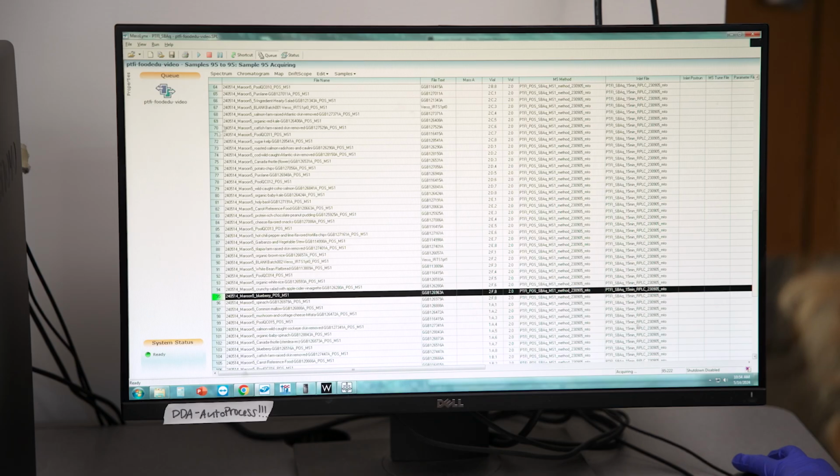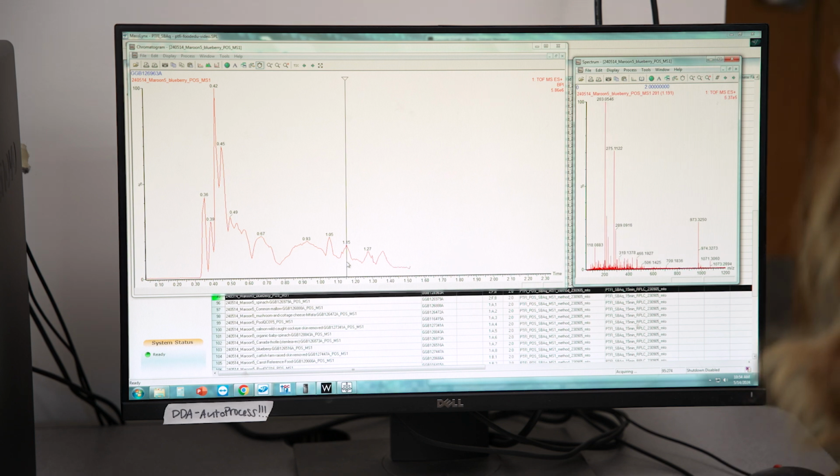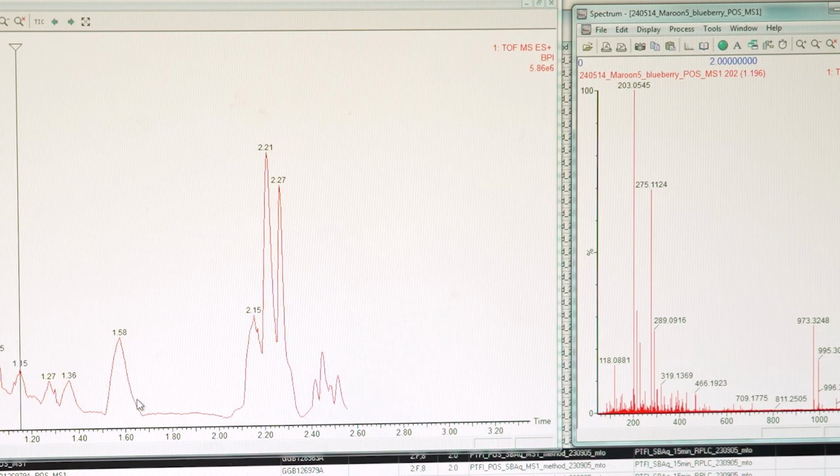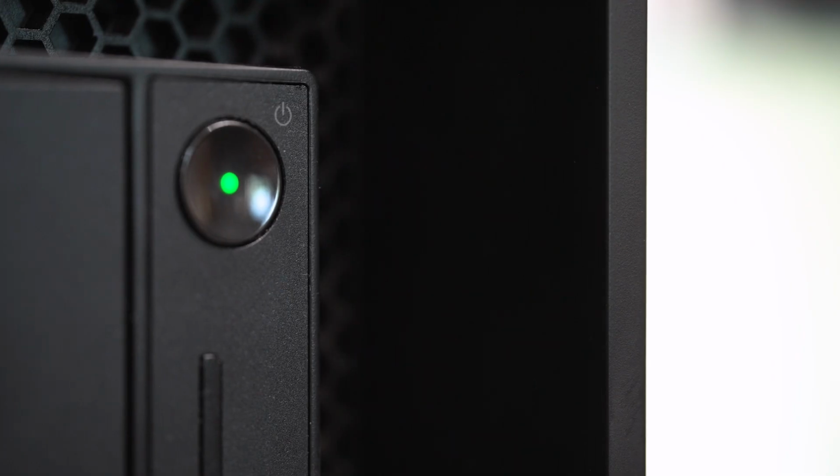This data acquisition can be visualized in real time by a chromatogram, which shows us the signal intensity for all of the detected molecules over time. The resulting data files are uploaded for further processing using the standardized PTFI data processing workflow, enabling evaluation of relative intensity changes for molecules that match to a global consensus library of formulas and authenticated standards.